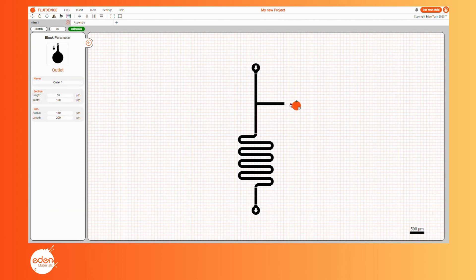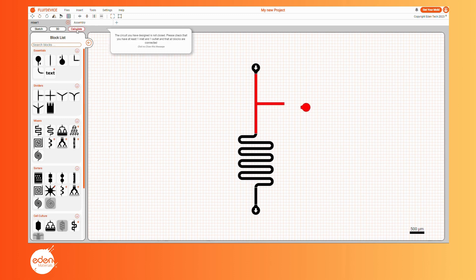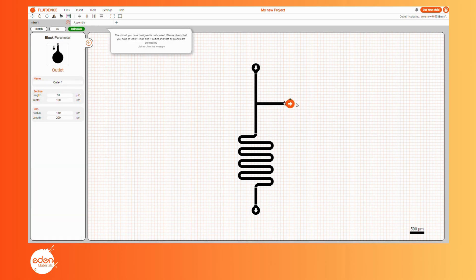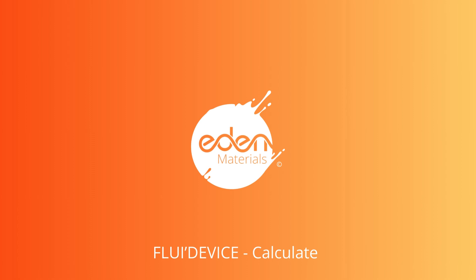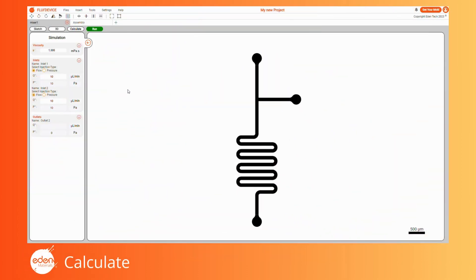You can then correct the snapping or select the blocks to return them to black. Now that your design is complete, you can observe its hydrodynamic properties. Click the Calculate button to open the calculator interface. When the calculator interface opens, the left menu is replaced with the simulation menu. Here you can adjust the fluid properties as well as the input and output conditions. When hovering over these editors, the corresponding block will light up to help you visualize what you are editing. For each inlet, you can select the injection mode — pressure or flow — and adjust the values and units.